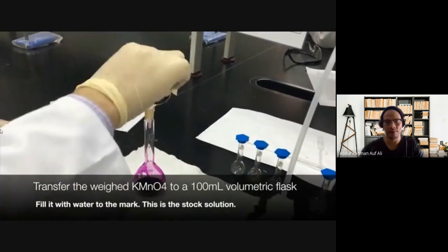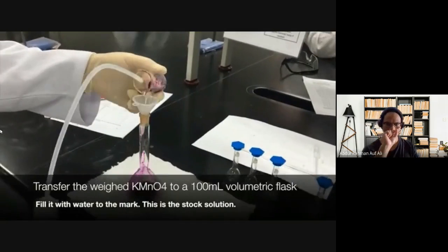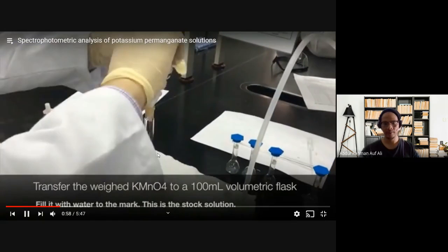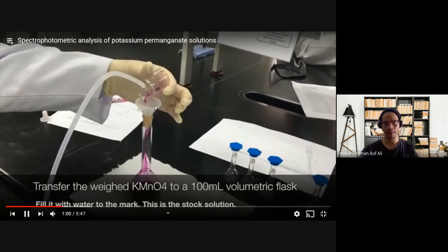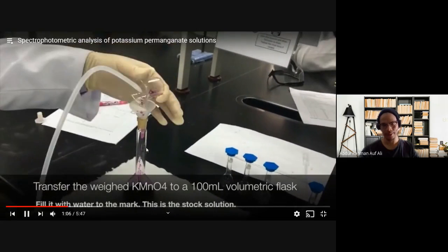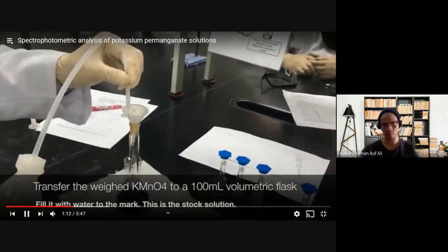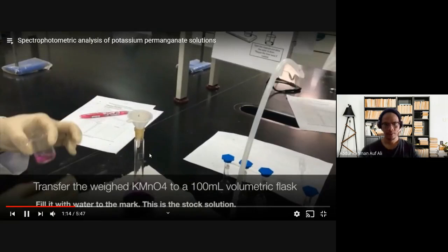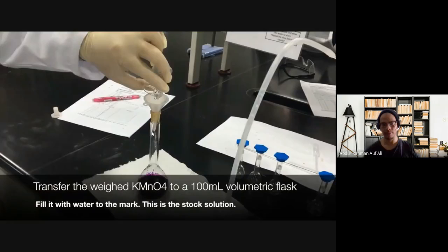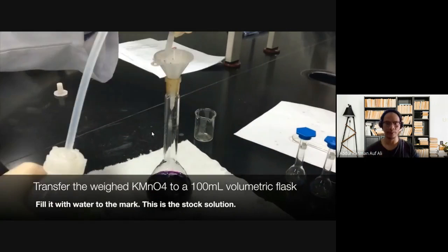This is a volumetric flask. Volumetric flask, once again, has no graduations. It only has one graduation line near the top of the neck. After we fill up the volumetric flask with potassium permanganate, we top up the solution in this glassware with water until the graduation line, so that we know we have 100 milliliter of solution. Now he is washing all the potassium permanganate in the beaker that was weighed. This is important because we weighed 126 mg, so we want to mix all 126 mg.